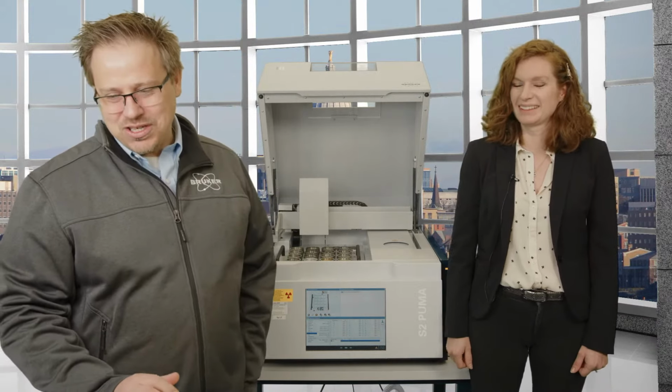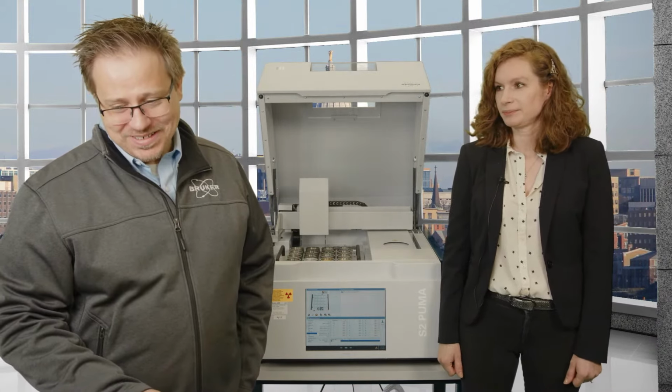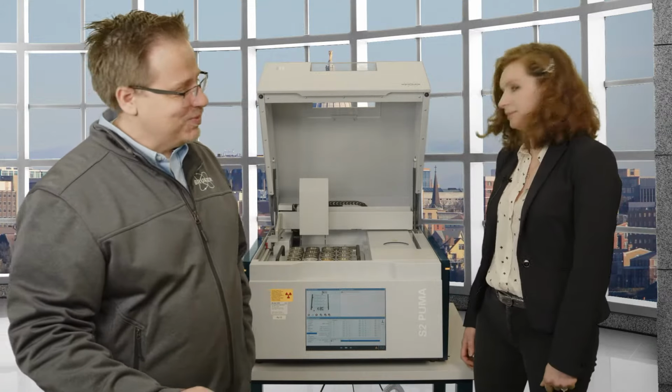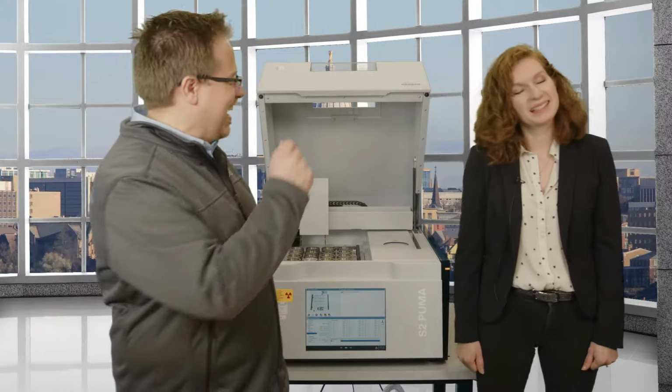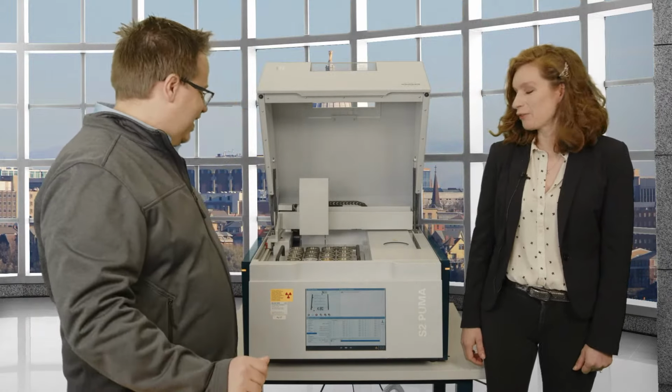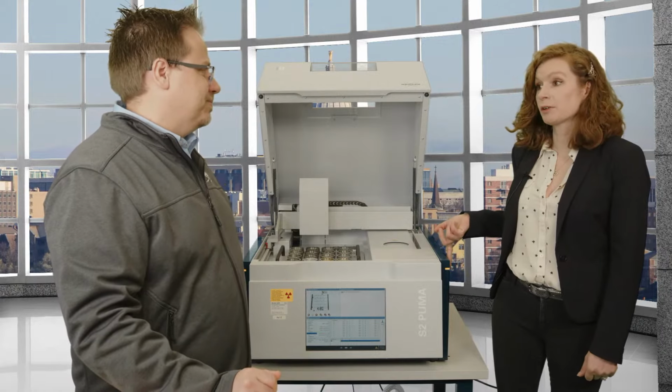All right. Next question is from Mike. Is it dangerous to be next to the machine, or even in the same room? No, it's not. I was going to say, depending on the answer, I might be leaving. No, first of all, this is shielded when the X-rays are on. It's also very low power.